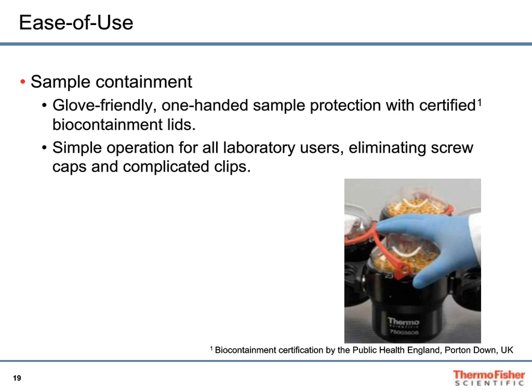Here, this would be a benchtop that you see in this picture, but even in a floor model, if there's a vacuum and these type of things being applied, that the sample is also safe in there. So make it easy to use these things, and then they will get used, and we can take advantage of that.